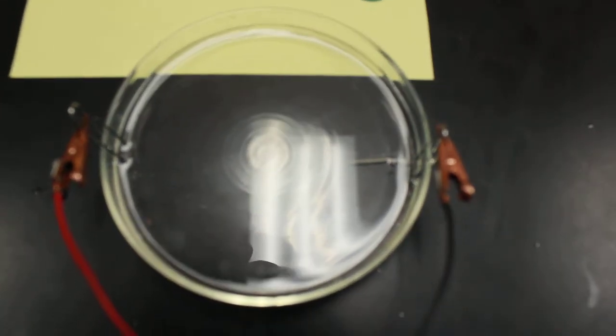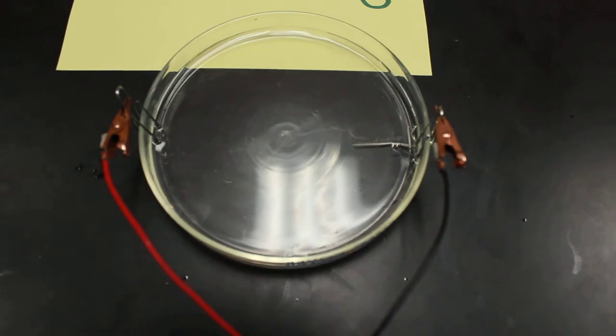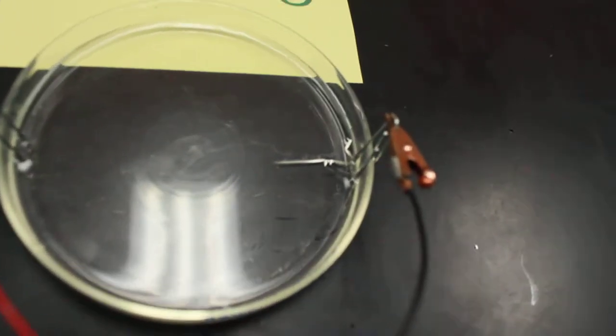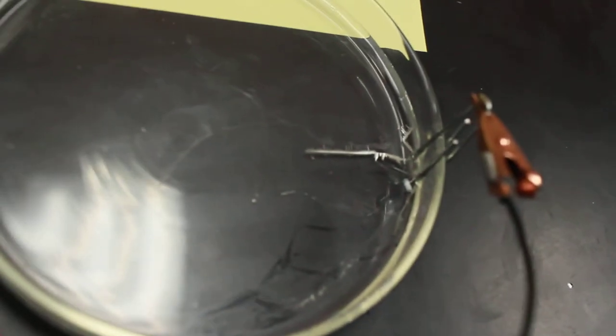And after a minute or so, we're going to switch the polarity of electrodes, just by simply changing which paperclip leads are attached to which side.